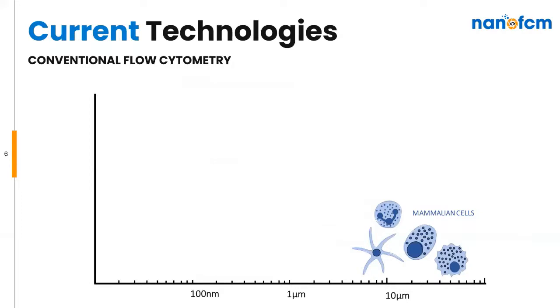One of the reasons that we think nano flow cytometry will become increasingly relied upon as a comprehensive EV analytic technique is that flow cytometry is already widely used and a very robust method. For those new to it, flow cytometry works by passing particles through a laser. Light scattered off particles is detected and then informs us about the presence of the particle and its size. Coloured light emitted by fluorescent probes conjugated to antibodies provides information on things such as surface proteins.